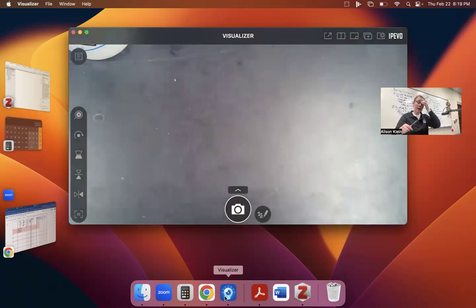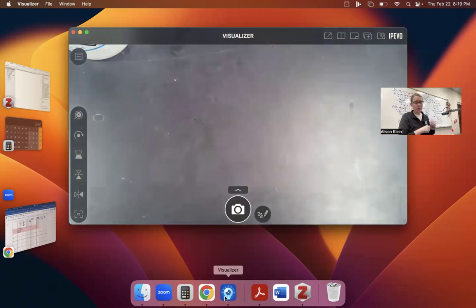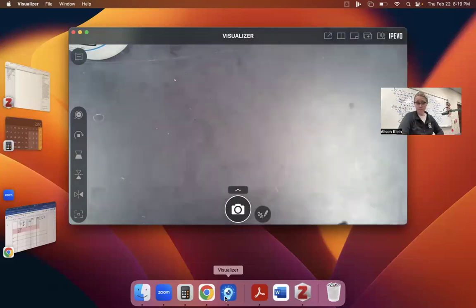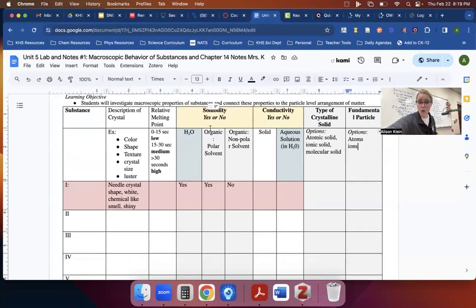Okay, and then record. And the key, super important: your test tubes have to be clean. So make sure that your test tubes are clean in between. When you're done, empty out your solution into your waste beaker. Make sure the waste beaker is covered and the waste beaker is below your snorkel vent. After you've run through each of those tests, once you're done, I want solvent containers and solvent bottles in the fume hood. So you're going to walk them over to the fume hood, and then your table will no longer have any liquids at it other than water. So I'm going to do that now.